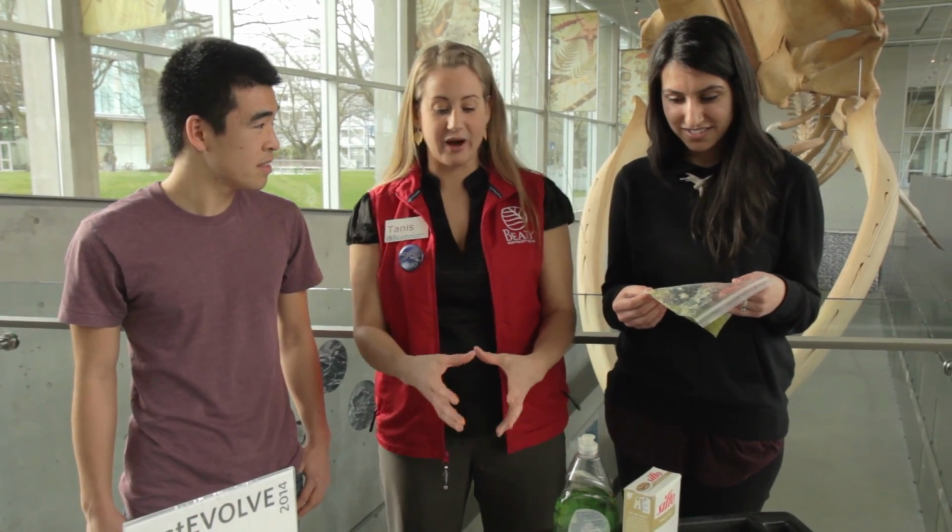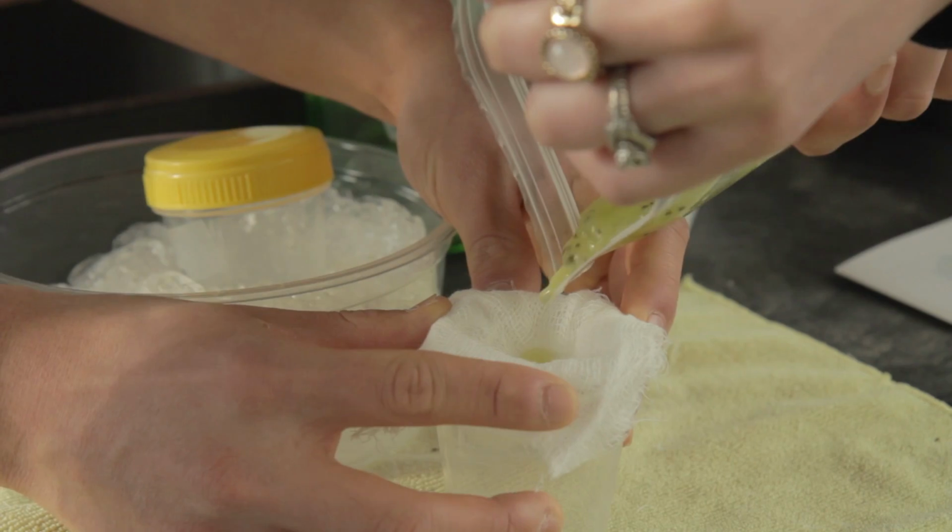Okay, so we've squished the kiwi, we've added the salt. What comes next? The next step is to get rid of all the large pieces of kiwi fruit. So we want to filter it through this piece of cheesecloth into a little container. Okay.